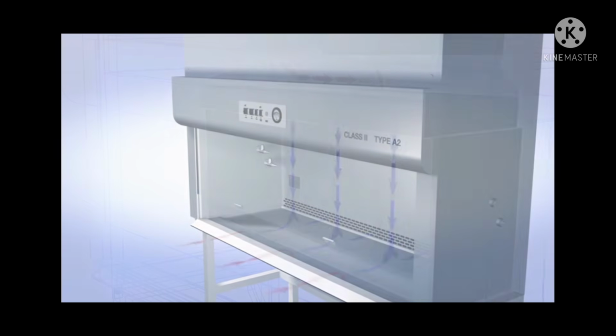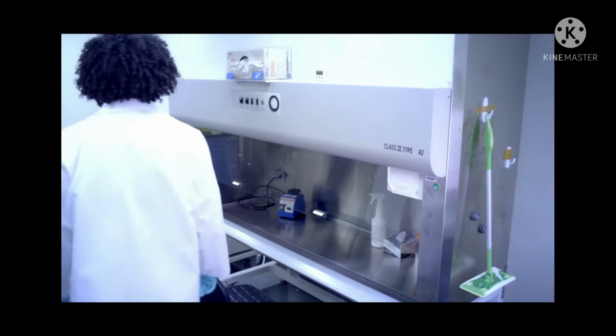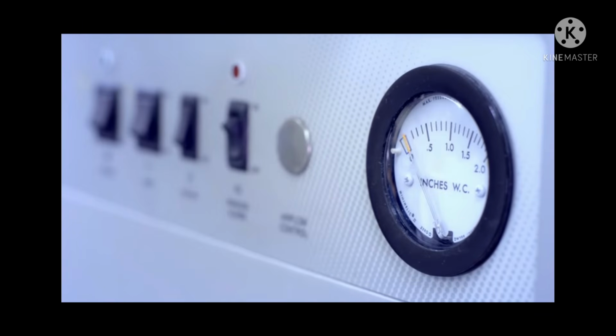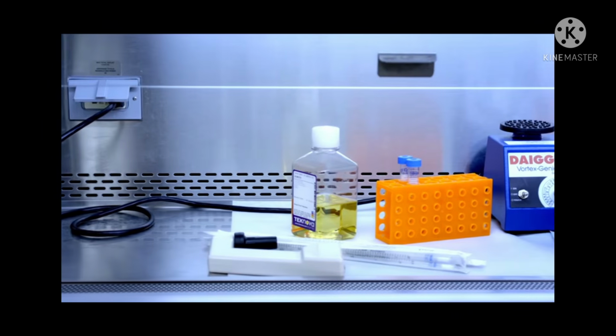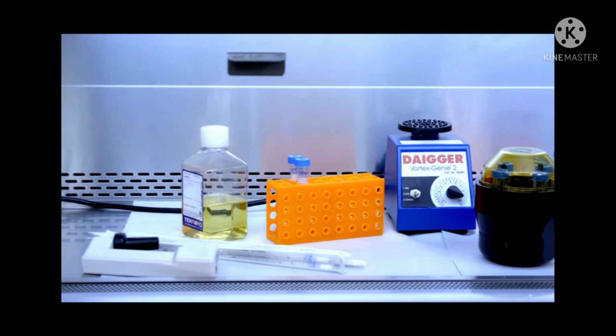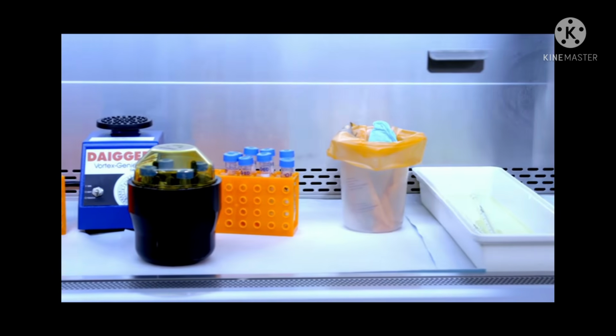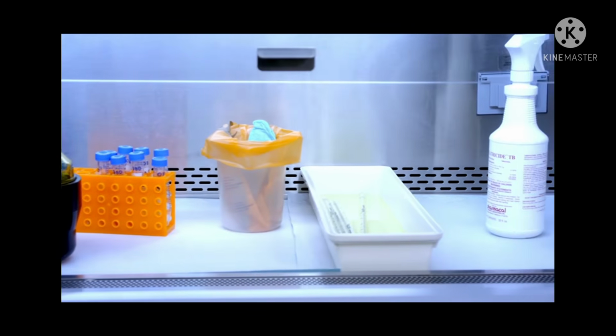1. If the cabinet has been turned off, you must turn it on and wait at least 15 minutes before beginning your work. 2. Set up the interior workspace to work from clean to dirty, and work consistently from one direction toward the other to prevent cross-contamination.